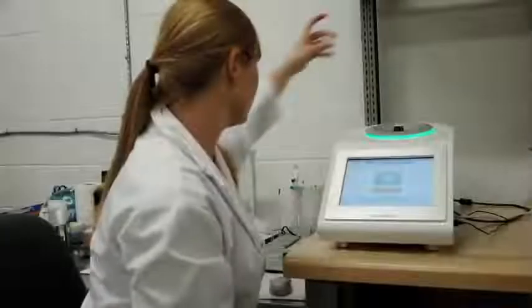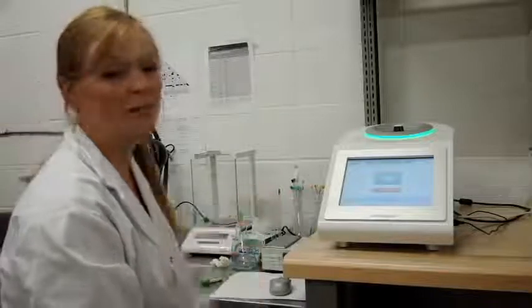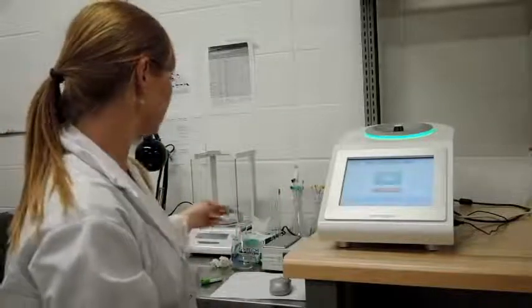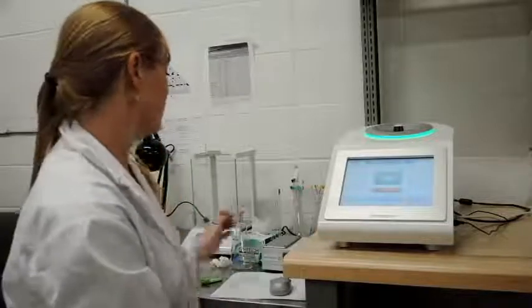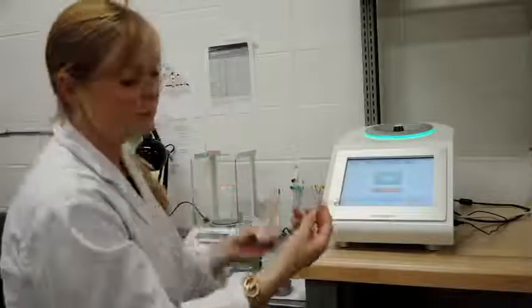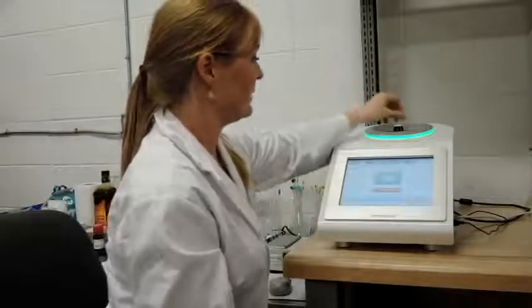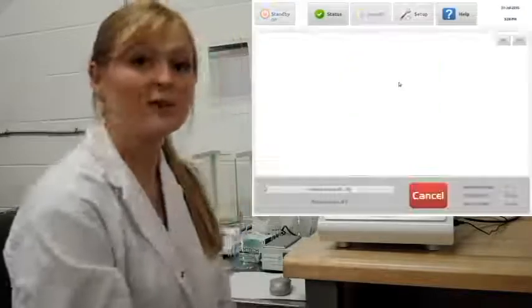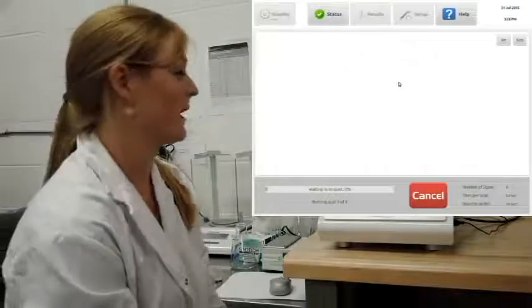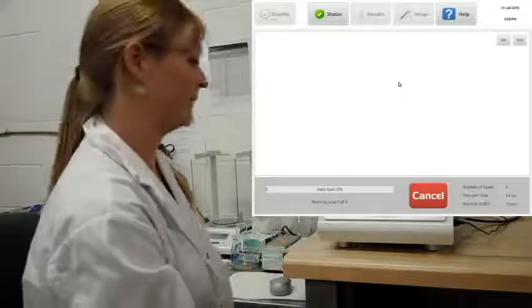And then before I finish, I just want to show one thing. So you may have noticed that I'm using this sample warmer as my tube holder. We do that because it extends the life of the optimal shims of the spectrometer, but you can easily run things that are at room temperature with no problem. So this is again the same ibuprofen solution, just at room temperature, and I'll just run a quick spectrum so you can see that there's no effect on the line shape when not using the sample warmer directly.